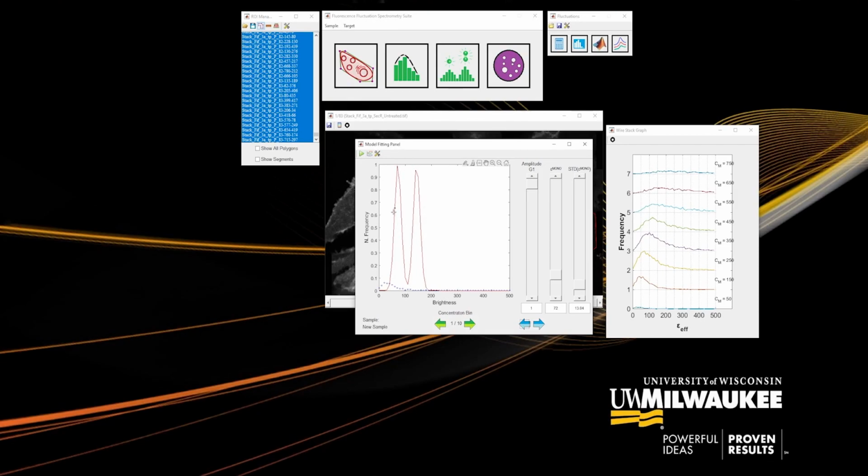The first Gaussian has a median at the effective monomeric brightness, which is set to 72. The second Gaussian has its median at double the effective monomeric brightness, so it's at 144. The second Gaussian represents where a dimer would appear. If you want to include higher order oligomers, you can open the settings window back up and add 4 for tetramers and 6 for hexamers.